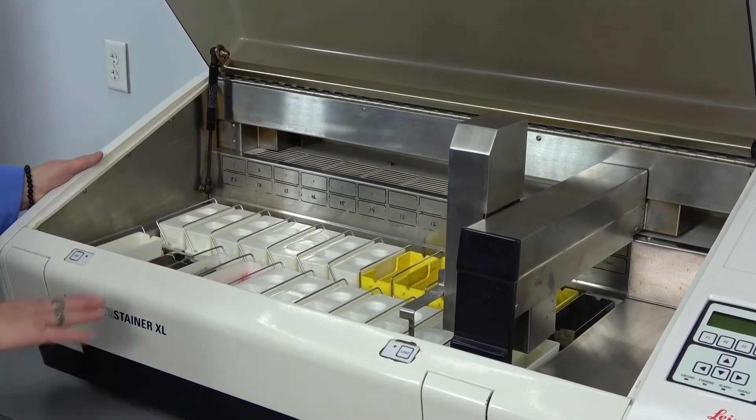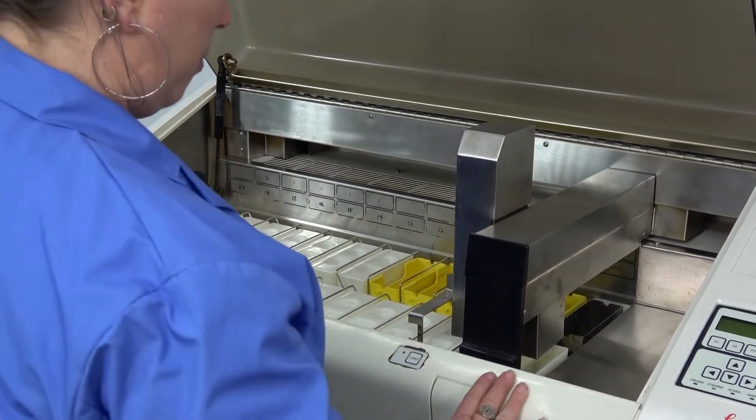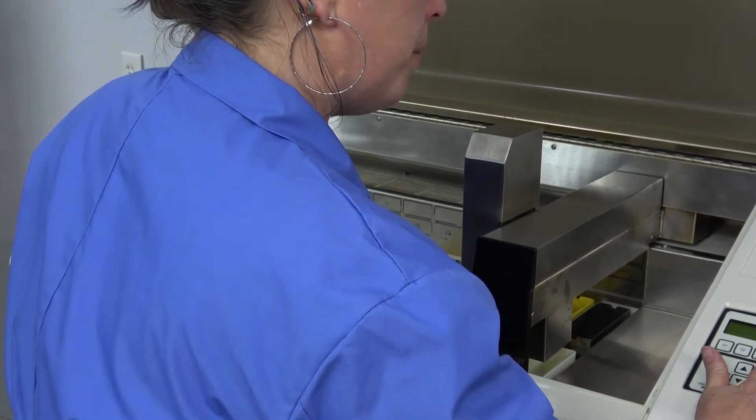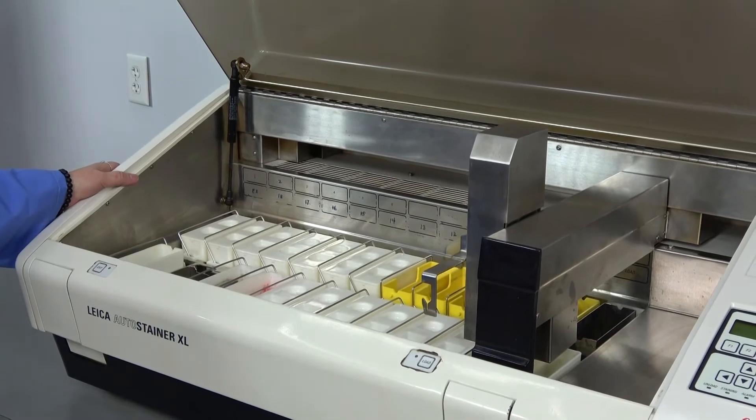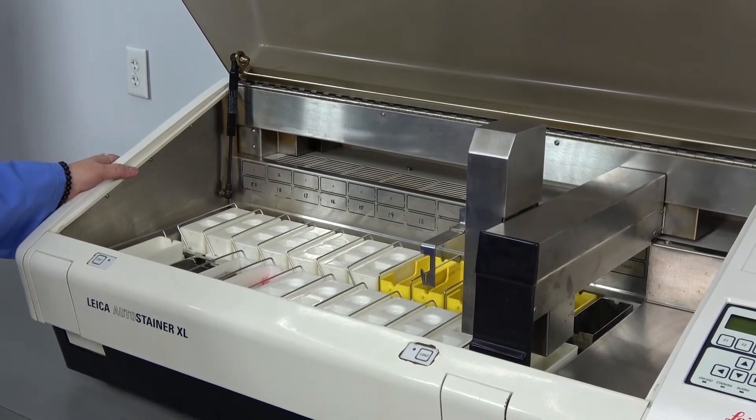You can exit out of this procedure at any point in time and it will pause in case of a power failure. It will also pick back up when the power starts back up again.